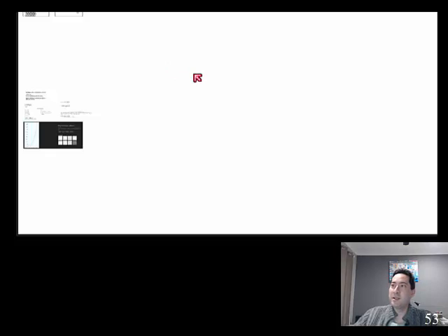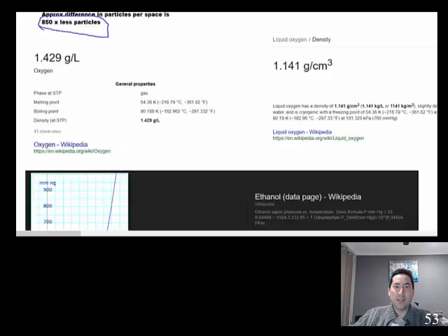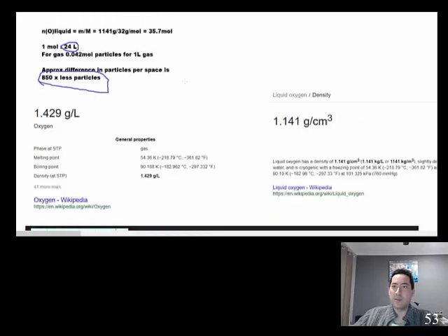Definitely some more reliable ones. This is probably the dodgiest one, and the one I haven't done for at least a year because I haven't been able to get it to work since I've come back to Australia, where I've done a lot of other just as cool ones that are probably a lot safer and definitely reliable. So this is the most unreliable one, I would say, although hydrogen's got a variable flash point, so that explosion can surprise you sometimes as well.